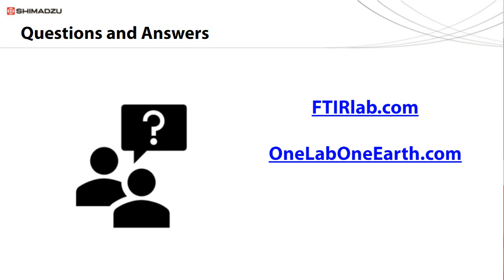All right, on to the next question for Ruth. What are the steps required for sample preparation before the analysis of microplastics by infrared? Thanks, Sudhir. The sample preparation depends on the amount of solids in the sample. So it's going to be different whether you are planning on analyzing a drinking water sample or an effluent from wastewater or wastewater influent.